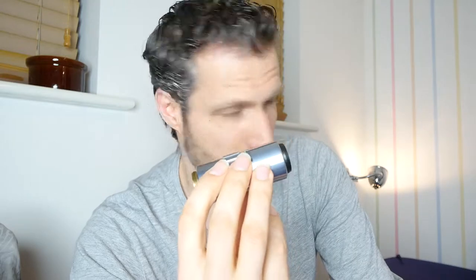Another thing is that they have amazing working distance. That means if you take pictures of insects or memory cards, you can go about this far from the lens, so you still have a lot of space, probably like 1 inch, where the light can go, like a flashlight or any light. The usual problem with microscopic lenses is that you have to go so close. Now, what I'm talking about: this particular lens has a numerical aperture of 0.42, which means it's pretty sharp. That 0.42 actually tells you the resolution power of the lens, a kind of sharpness, I believe.